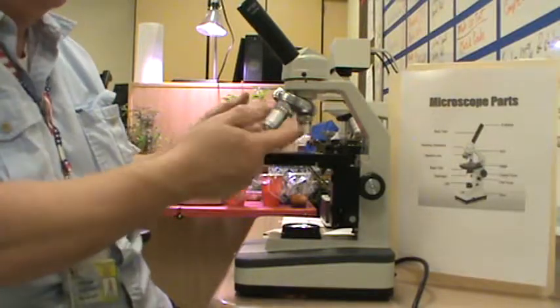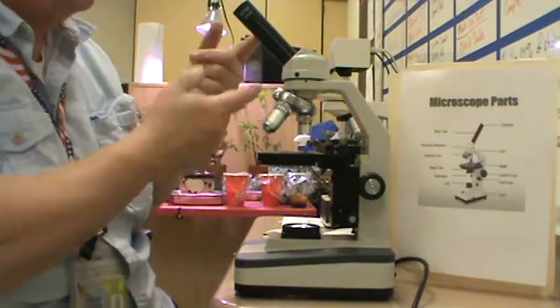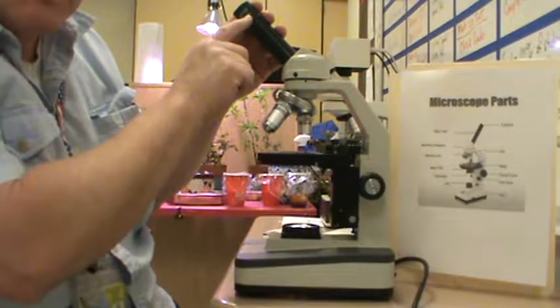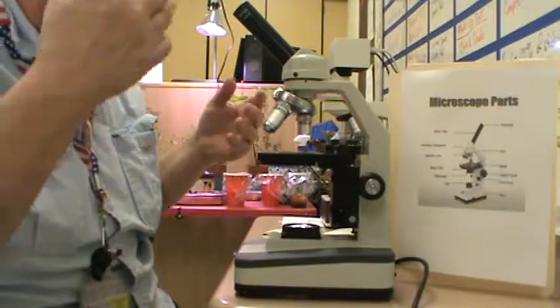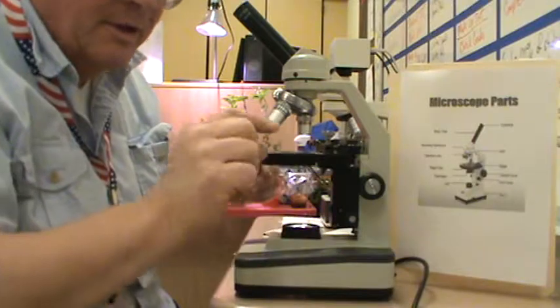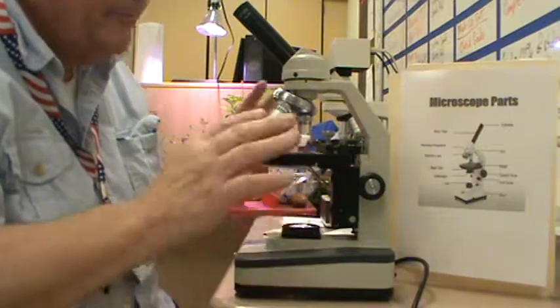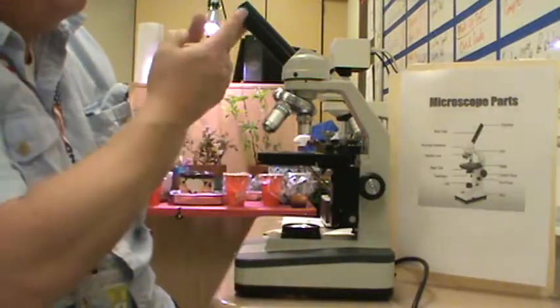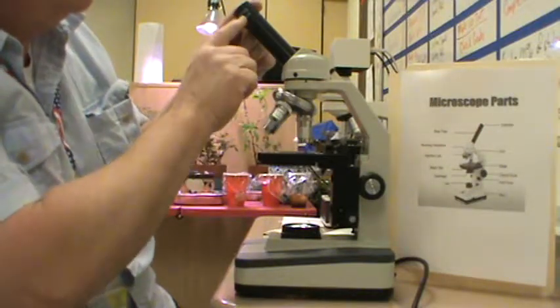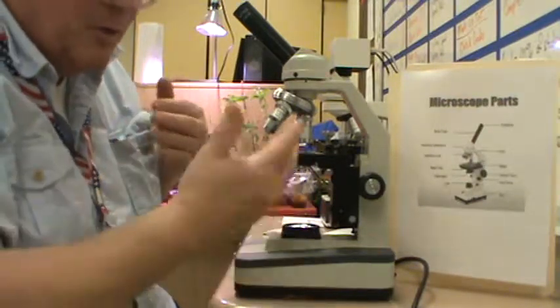And then we always start on the lowest power. Now, when we talk about observing in a microscope, the eyepiece normally provides us with 10 times the normal magnification of what you see with your eyes. I can see 10 times closer, 10 times smaller, maybe you want to say 10 times better. However you want to remember it, that's fine. But not only do I have this lens, I have the lens down here. In this case, this is 10 times 4 times. So 10 times 4 is 40 times my normal vision.